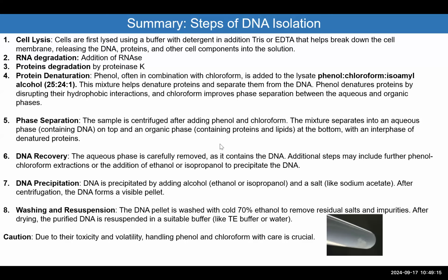Okay, so in this setup, it was meant that I want only DNA from my cells. I don't care about the proteins and about the RNA. And this is an old protocol. The reason why I went through this protocol is that I really want you to understand things, not memorize them, or see them without knowing what they are.